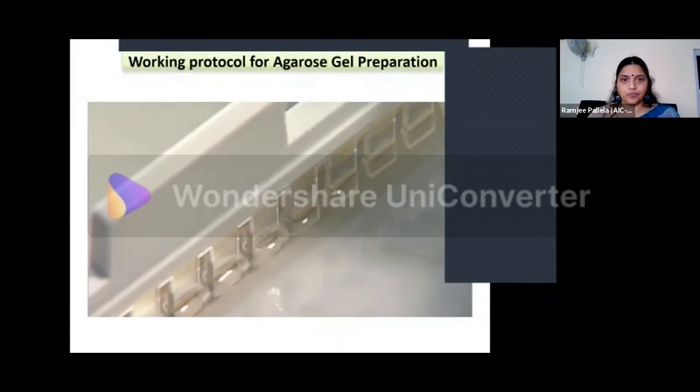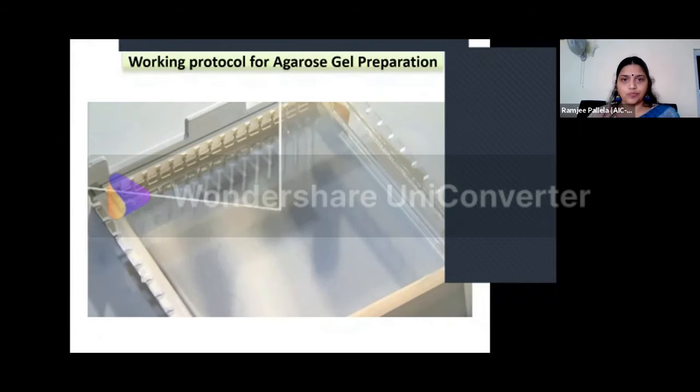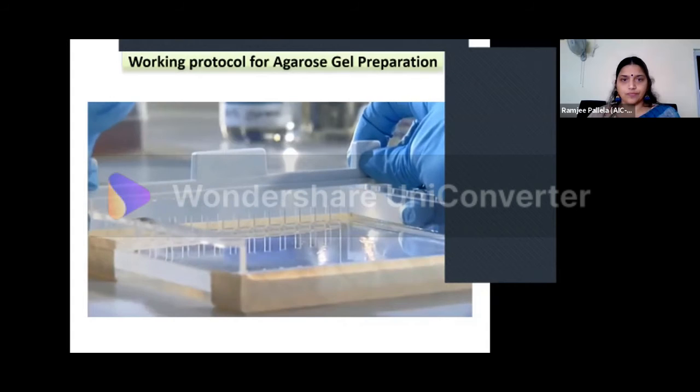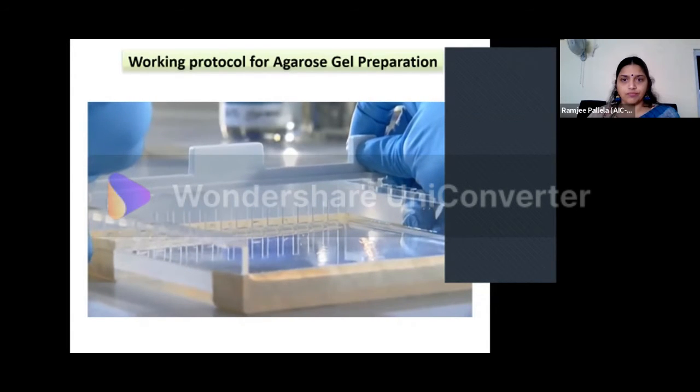It takes about 20 minutes for the gel to solidify, during which it will change from colourless to slightly opaque. While the gel is setting, don't move the gel tray or disturb the gel itself, since this can create a gel of non-uniform thickness. Once the gel is set, you can remove the comb. Slowly and carefully pull the comb upwards vertically. You'll feel some resistance as the comb comes out of the gel.